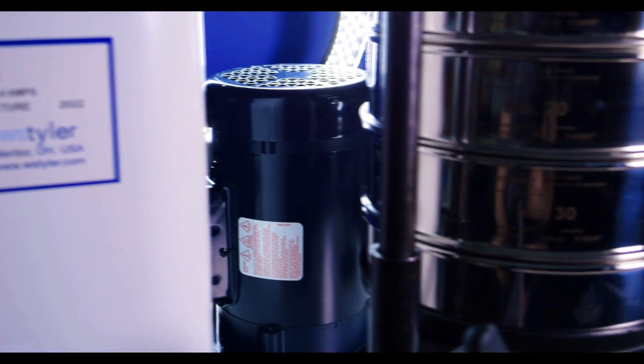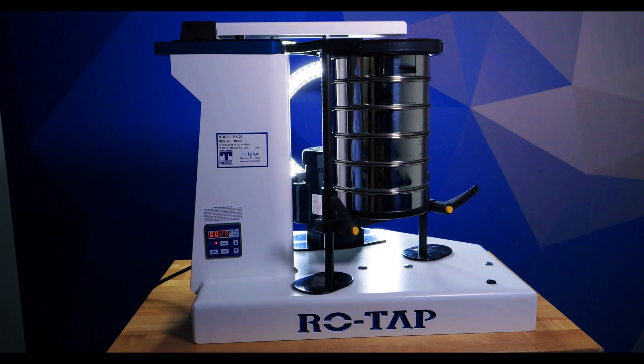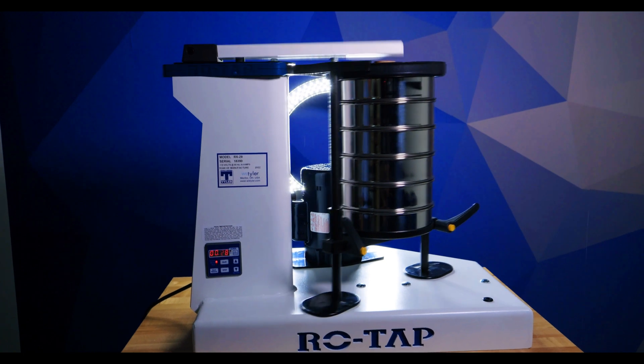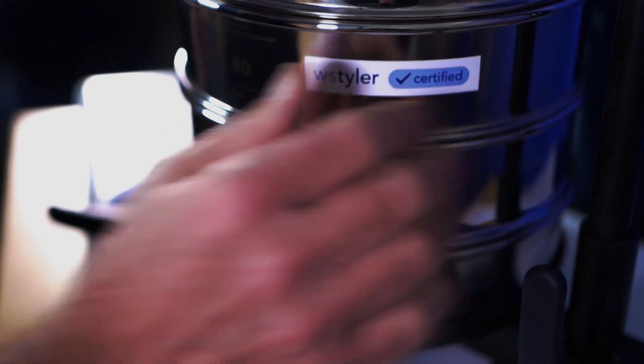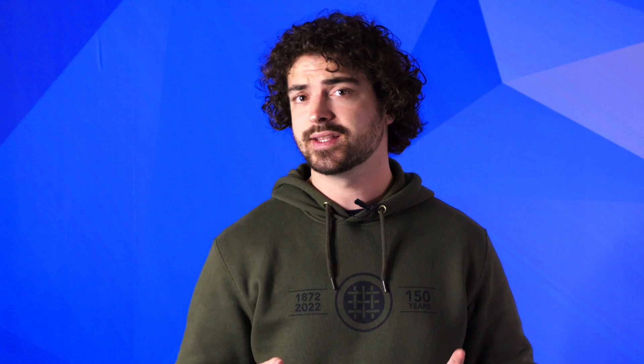The ROTAP RX29 uses a motorized system to drive the oscillating motion and brute force hammer taps it's famous for. This moves the particles on each sieve in a flat plane while forcing them through the mesh openings of the test sieves. When it comes to operating the device, the RX29 is very user-friendly — lab operators just need to place their test sieve stack, adjust the stack height, set the test duration, and press the start button. It is recommended, however, to conduct an end-of-sieving analysis before using the device for the first time.